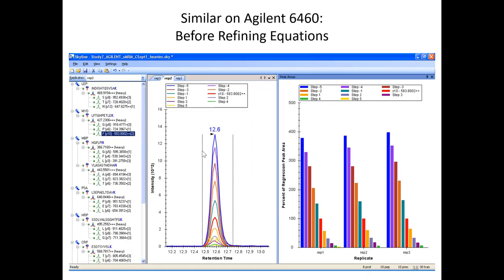This is on a different instrument, same peptide. It's just highlighting the +2 product ion and showing that this is the one that, without empirical data, Skyline would have said is good, but it will end up being something that's many volts less and increases the signal by like 3-fold. So that's impactful.